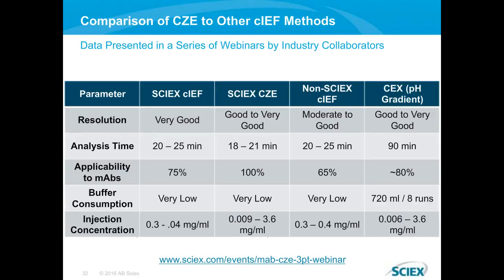So CIEF, very good resolution, same thing with CZE, good to very good. The analysis time, again, they were using a bit of a longer capillary length, I believe, which is why you're getting 18 minutes for the separation time on CZE and not the 8 to 10 that I've been telling you about. Applicability to mAbs, 100% for CZE.